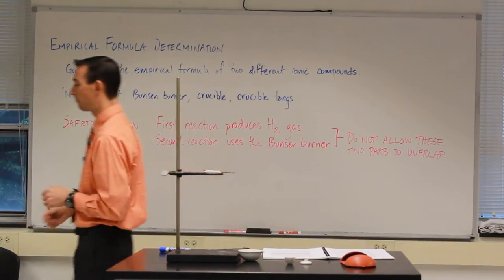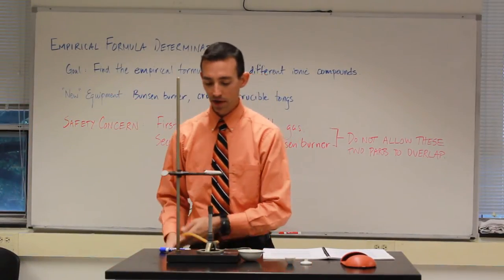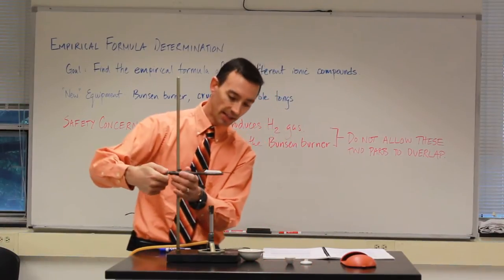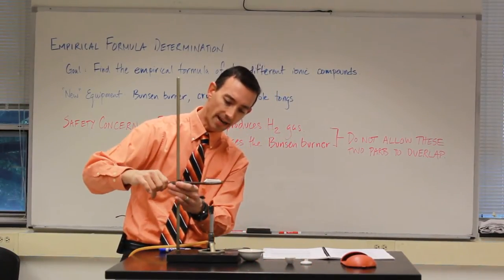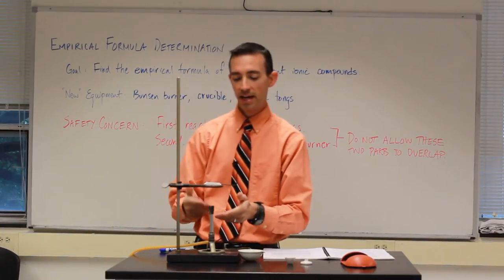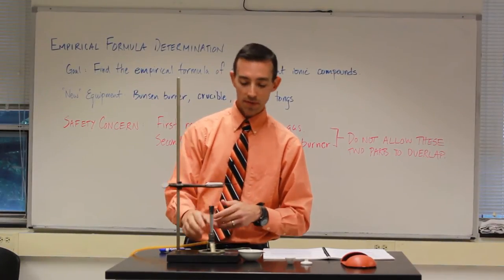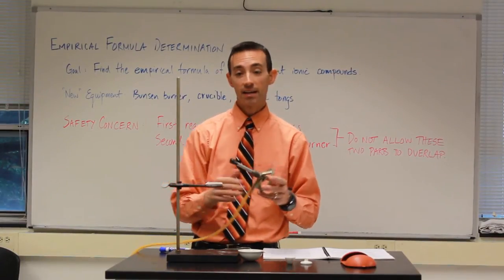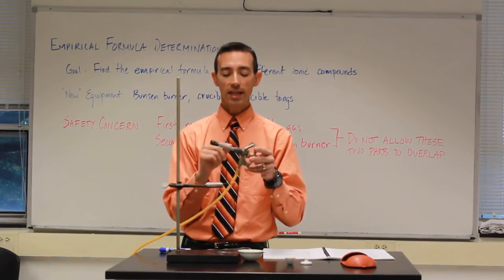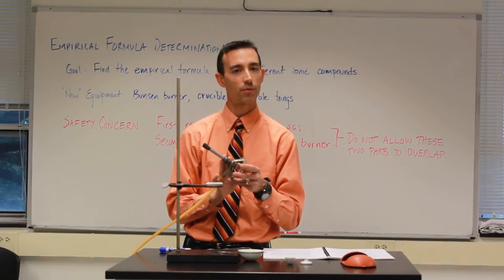You'll also be using the Bunsen burner today in the lab. So when you set up your Bunsen burner, please give some thought to how high your iron ring is. This is probably a little bit too high right now, so I'll simply adjust the securing screw on the side, and bring the iron ring up or down. The other part of the Bunsen burner will be tuning it using the shaft, which you can turn. This lets more or less air in to mix with the natural gas that we're burning.